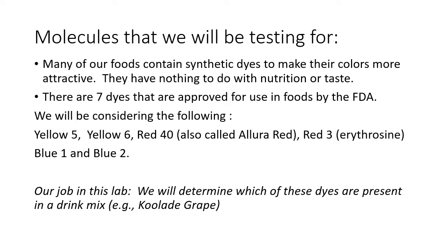Okay, so what we're doing is testing for the presence of particular molecules in some food dye mixes. For example, Kool-Aid, Mio, various mixes that have pretty colors that have nothing whatever to do with the taste or nutrition of those things. They're there to be attractive to us.